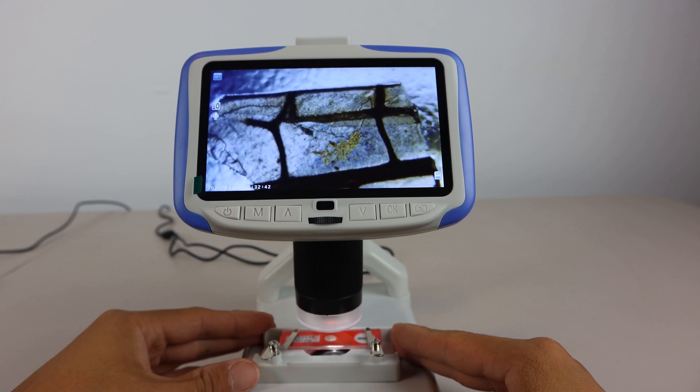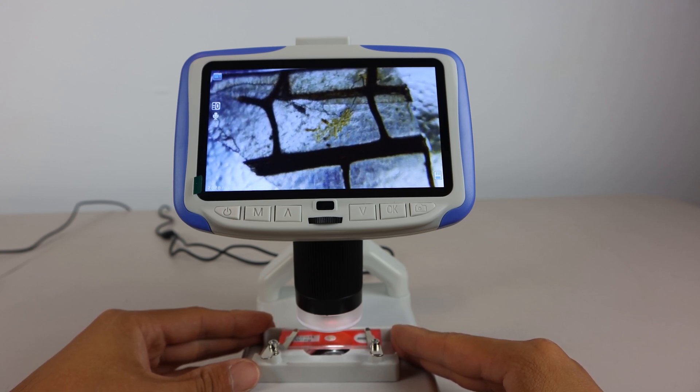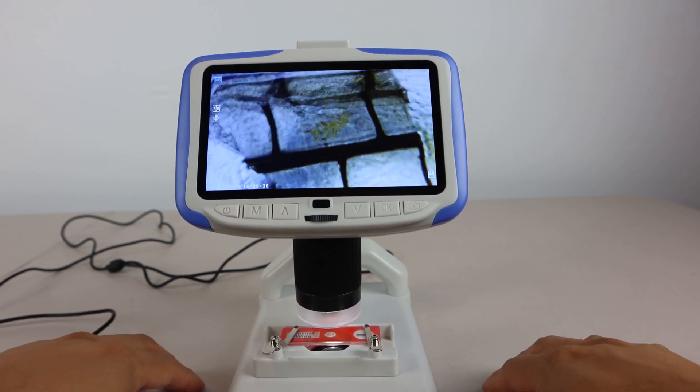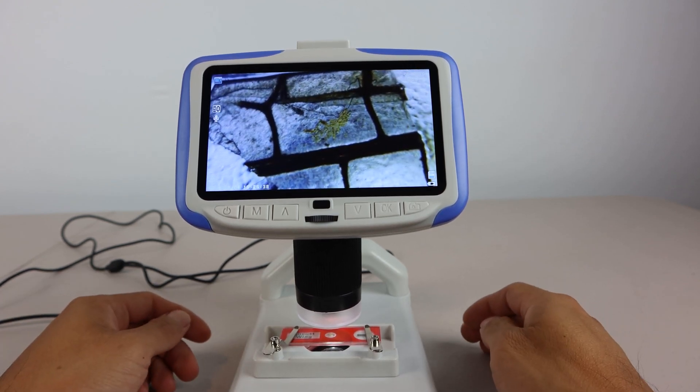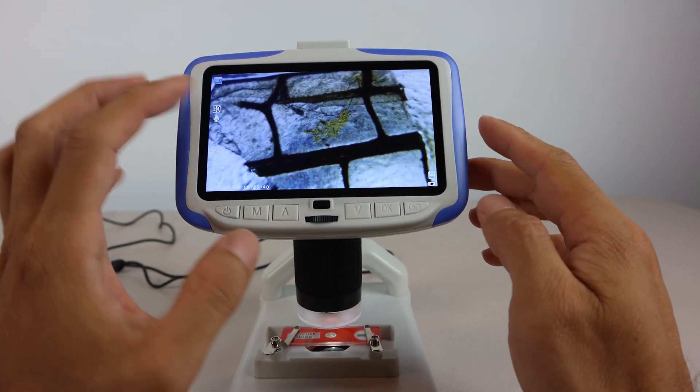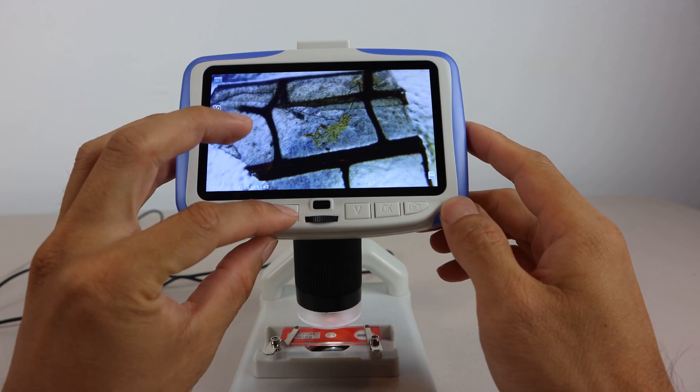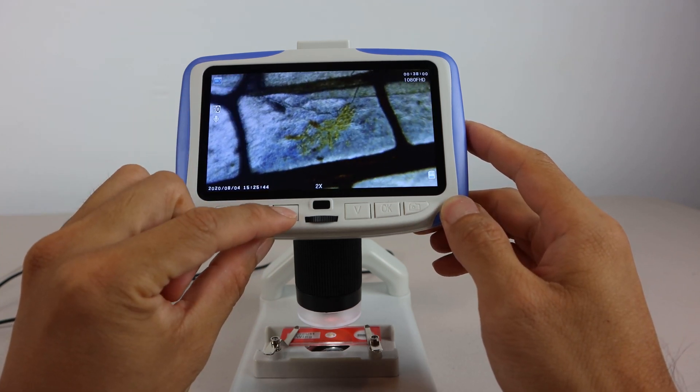The microscope is quite sensitive to table vibrations. When I tap the table, the image will shake around for a bit before stabilizing. This is also true if you touch the LCD, for example, to zoom in or out using the physical controls.